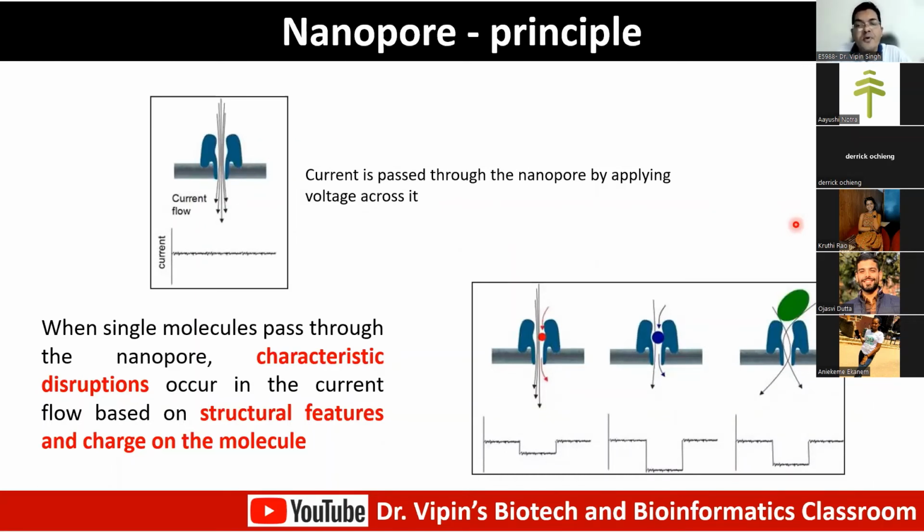And what is also important here is that even a methylated cytosine will produce a different fluctuation as compared to a non-methylated cytosine. So therefore, here you can also study the epigenetic state of your genome without going through a very complicated process of bisulfite sequencing, which is done in the Illumina process, right? So this is where the advantage is. One, you get long reads. Second, you can also get a readout of your epigenetic state of the genome without any special treatment of the DNA, right?